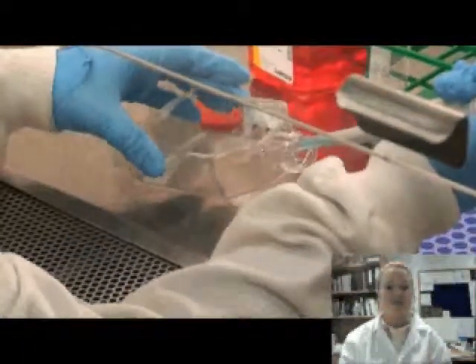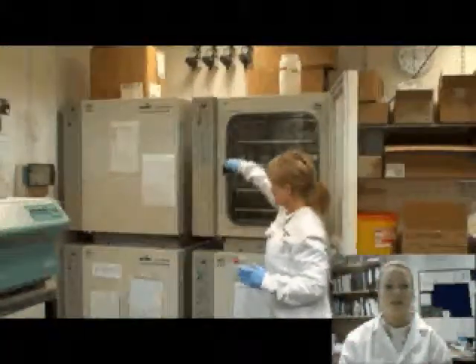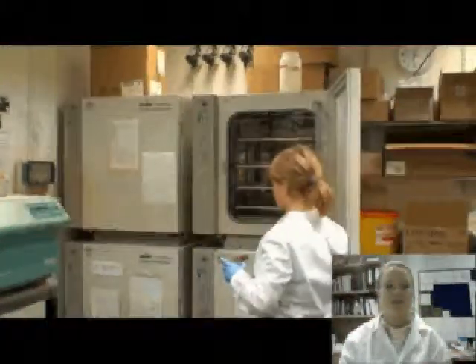I am now aspirating off the PBS and trypsinizing the cells with 1ml of trypsin. I am placing them back in the incubator at 37 degrees for 5 minutes.